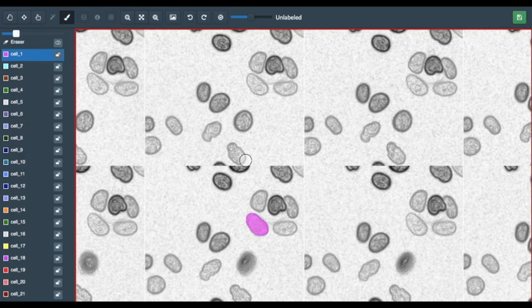It's important to color in the cell very carefully, coloring exactly to the cell boundary. It's easier to see if you go over the lines by adjusting the transparency like so. If you make a mistake, use the undo button here, or the eraser button here. To use the eraser, you must also unlock the color you wish to erase. You can also change the size of both the paintbrush and the eraser by using this slider here.